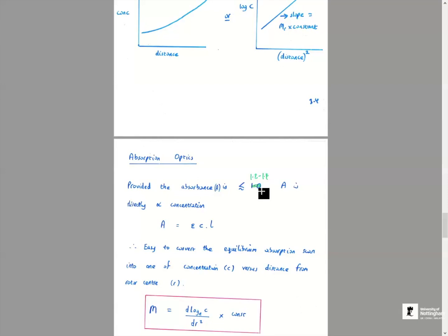But on the ultracentrifuge, the optical system wasn't quite as developed as a spectrophotometer, so we would always stay below 1.0. Now, with improvements, we can go to 1.2, 1.4. And Glenn, if you had a really expensive spectrophotometer, we said to the ABT group we could go up to 1.5, didn't we? Yeah. As the limit.